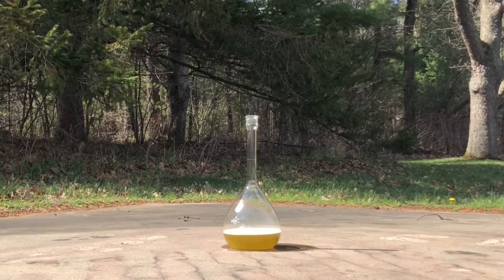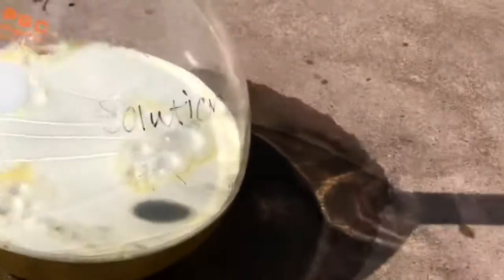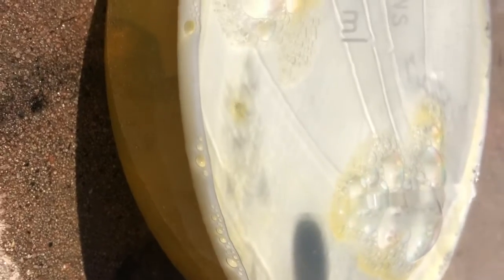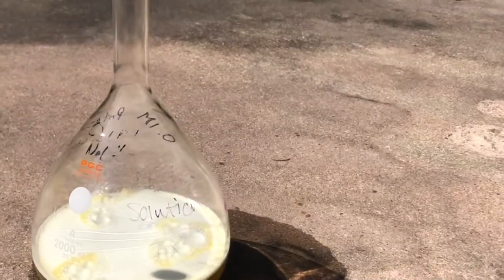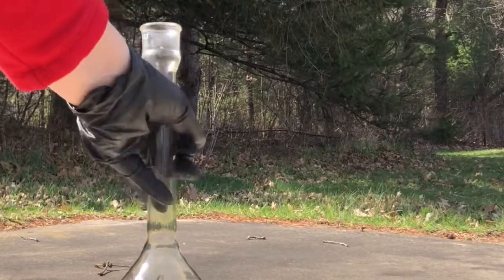I'm going to take you in closer so you can see what's happening. We got some bubbles down there going, a little bit of foam. Not a lot of action, but we are making oxygen gas. Give it a little stir.